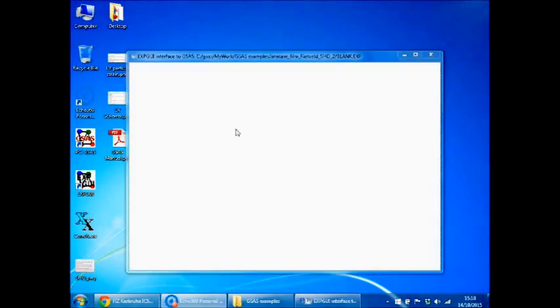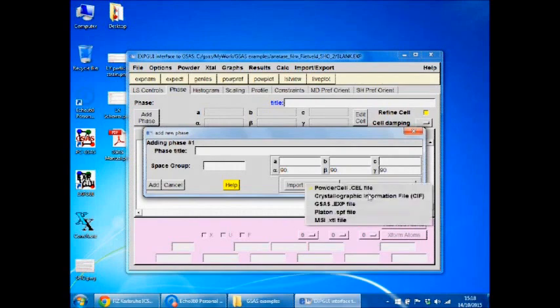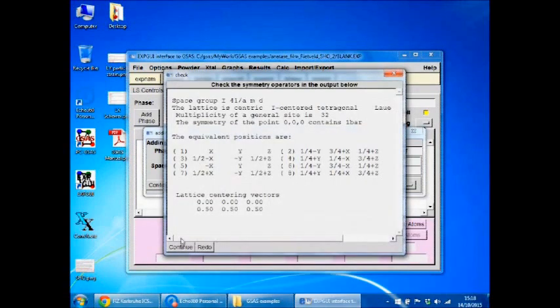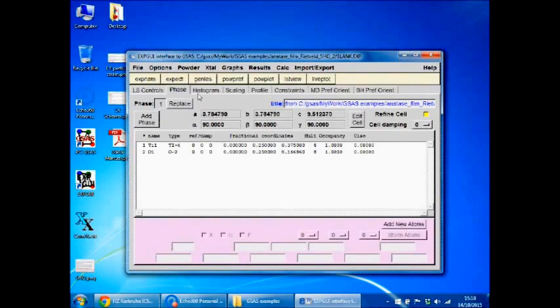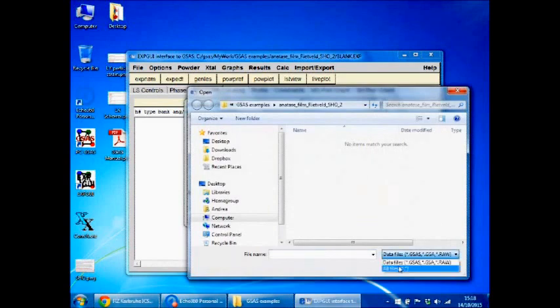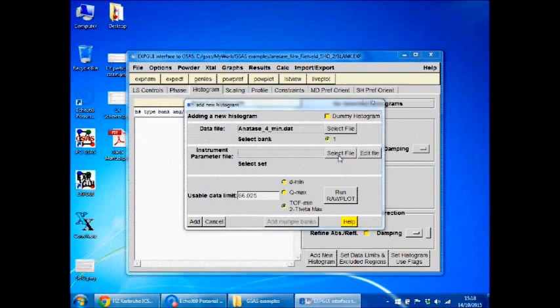The difference between these samples is so simple. One sample I made by chemical vapor deposition using a set of parameters, and my deposition time was 2 minutes. For the second material, I did exactly the same thing, but my deposition time was 4 minutes.